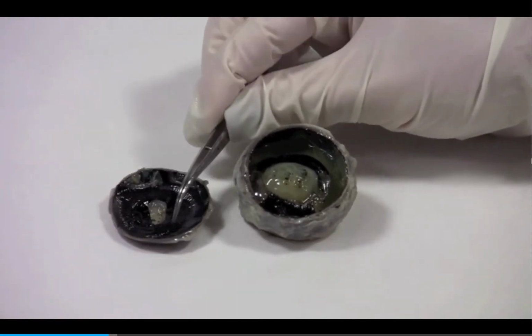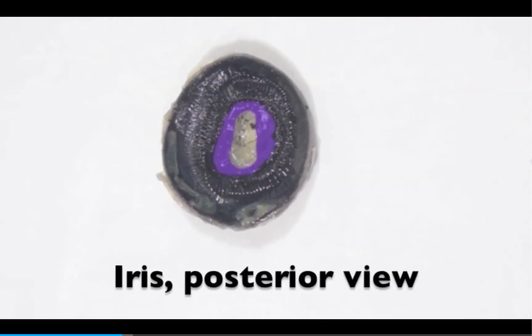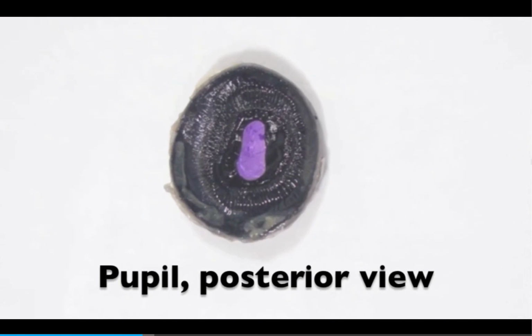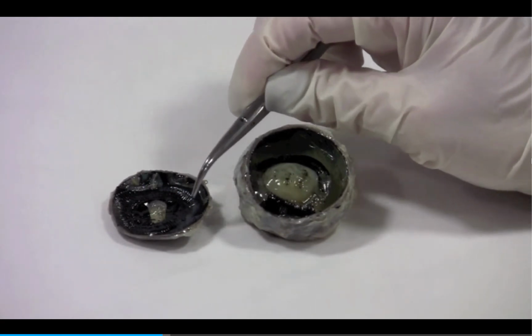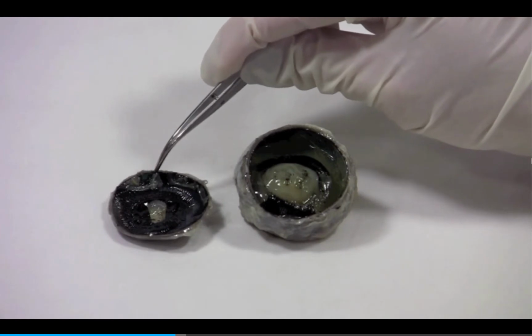Here we can see the back of the iris, and the pupil. The dark area surrounding the iris is known as the ciliary body. The ciliary body helps to anchor the lens in place through the suspensory ligaments.